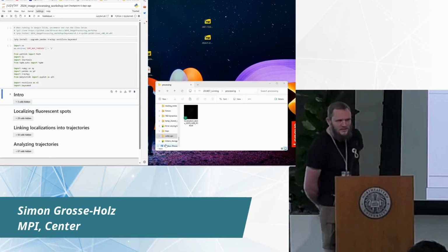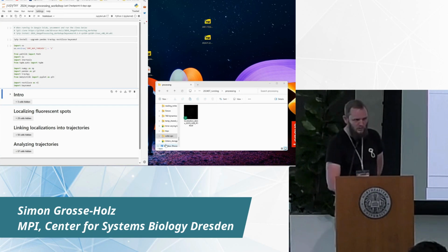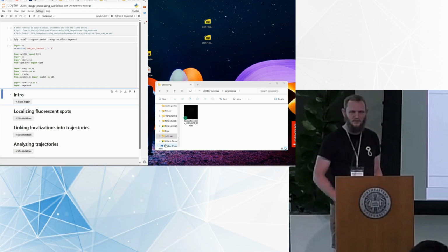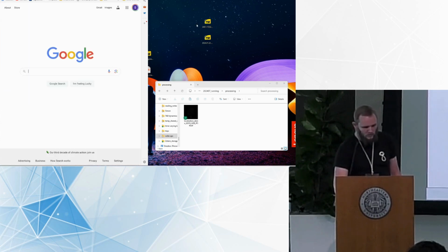Yeah, likewise. Maybe before we get going, I can briefly show people how to set up the Google Colab that we're going to be using for this work. So this is actually for the second half of the workshop. We can just quickly take a look. You can also follow along in the notebook as I do stuff.